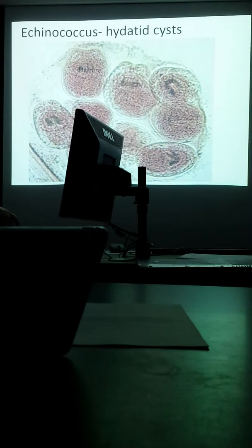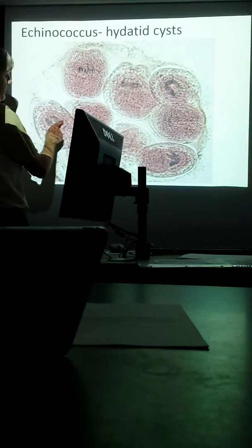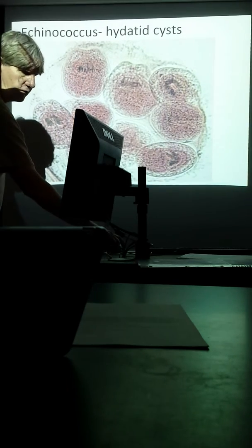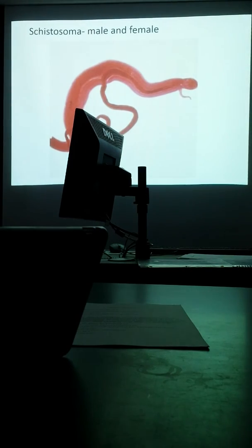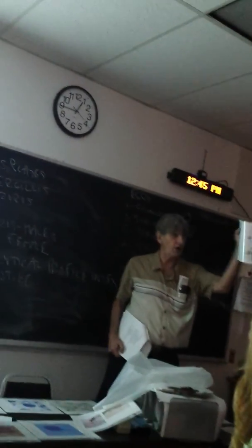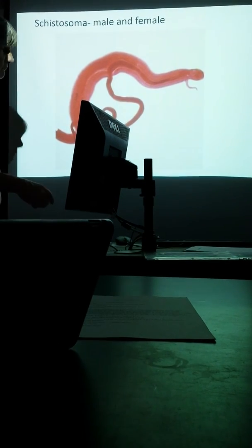The Echinococcus hydatid cyst structure. Got some pictures, a little better pictures of it over there, but what you have is this big circular deal. These black things on the interior are the inverted scolices, and the picture I have here is the one that you want to really make sure you get for that. It's clear right here, so one on each side. So make sure you take a picture of that. I would use that. I can't ask you to look at that on a slide, but it would be on something looking like that over there.